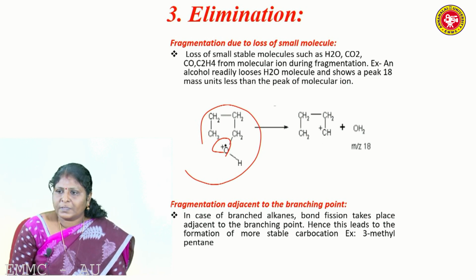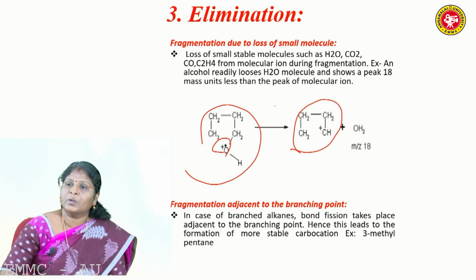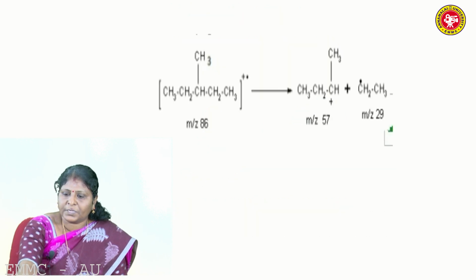One molecule of water is eliminated, thereby the cation is produced. This may undergo further fragmentation. This is how the fragmentation is affected. By the elimination of one molecule only, the fragmentation is affected. This is one of the modes of fragmentation.